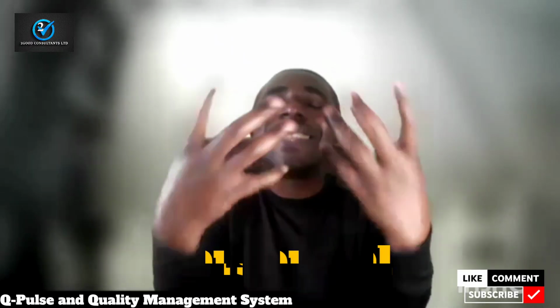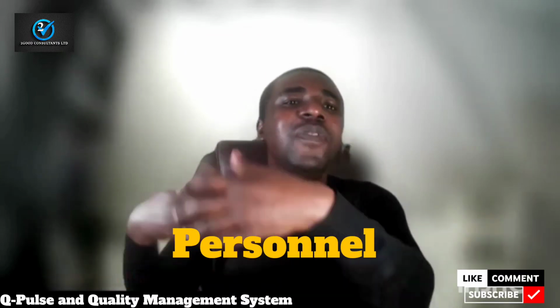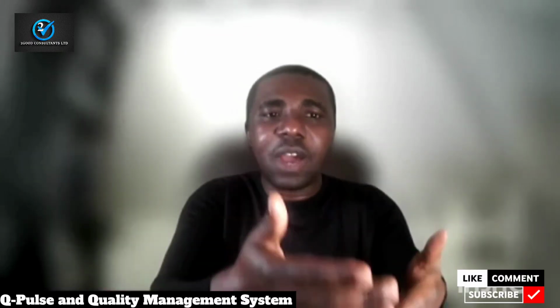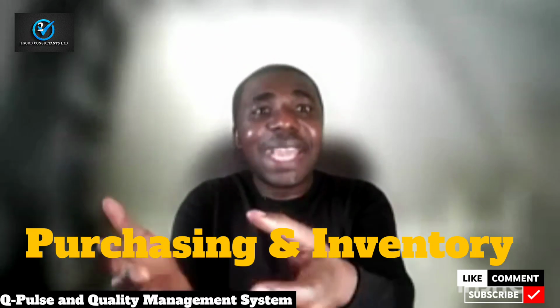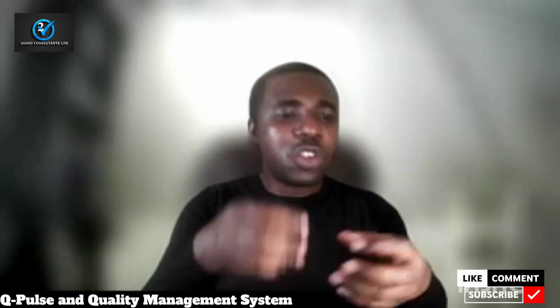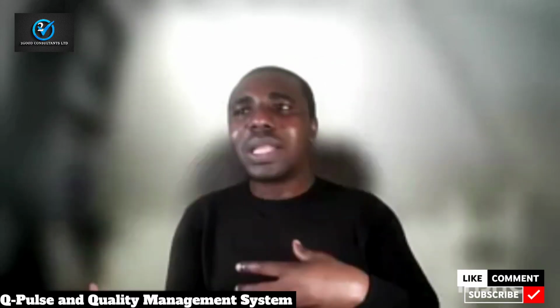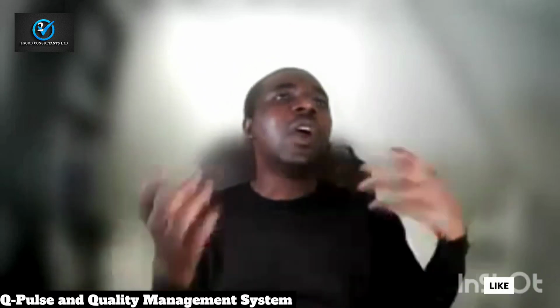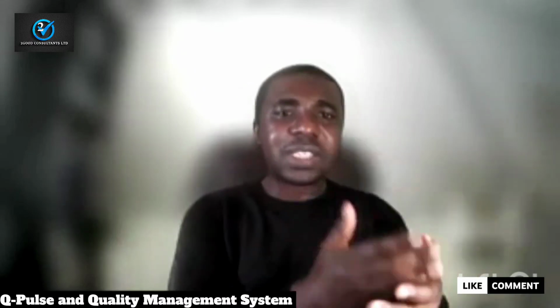Then you can have personnel, which means the qualification of people who are working there. They will have purchasing and inventory, which is also another aspect that will be vital for you as well, okay? So we can know what we need, okay? And what's the number of the stock that we have? When do we need to replace it? What do we need to do once it is delivered and all of that, okay? That becomes purchasing and inventory.